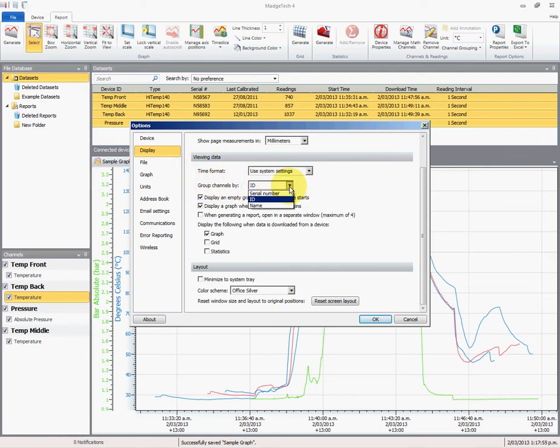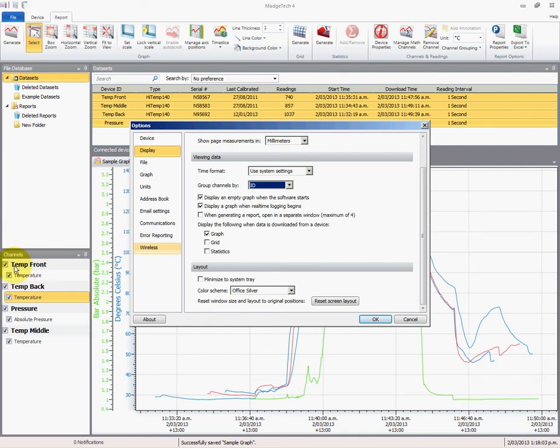This is what we're talking about on the right-hand side here. We've got these channels, and each data logger I have given an ID. Because they have a unique ID, they appear separately, and that gives me my title and the key.